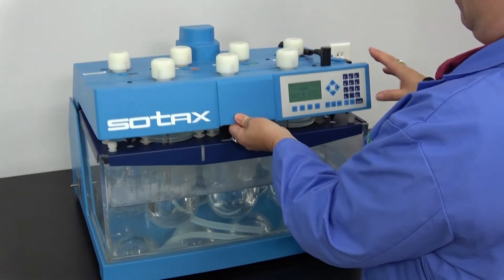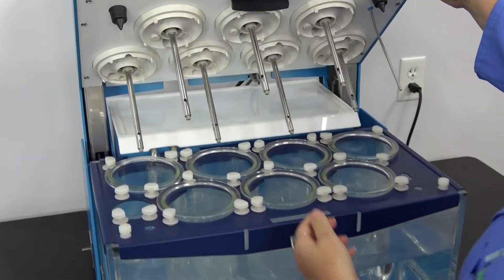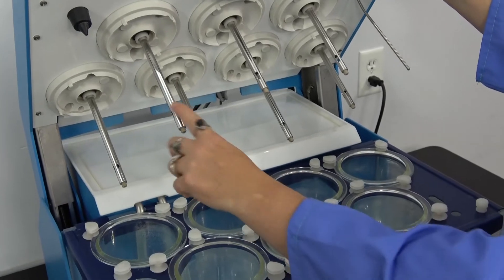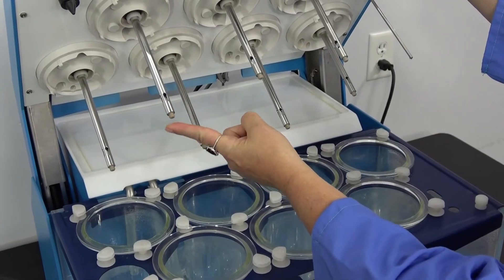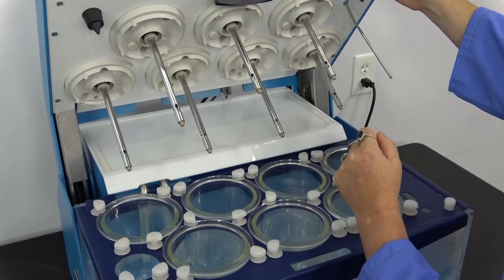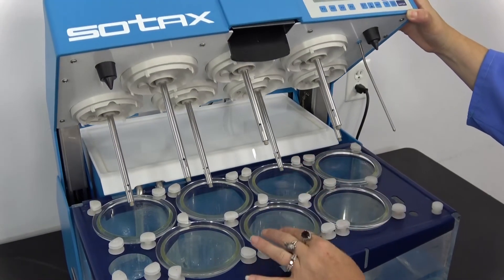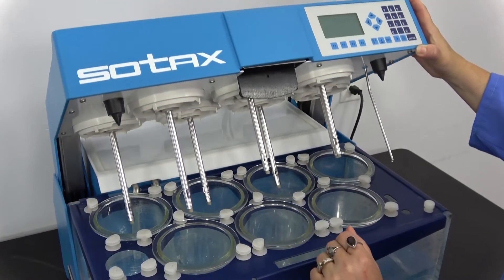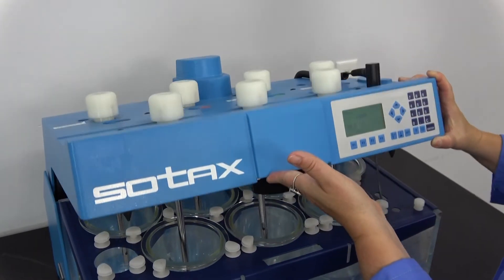It opens easily with the latch in the middle and lifts back. As you can see, it can be used with paddles or baskets, whichever you need for your operation. It has the glass vessels, lower this back down.